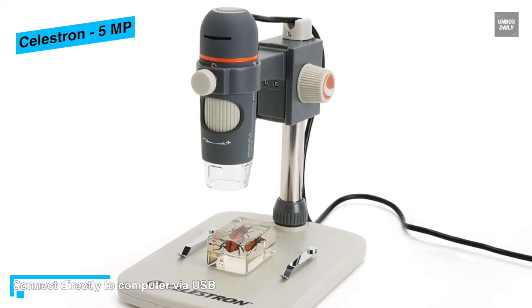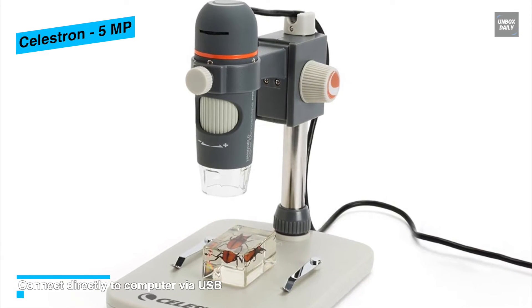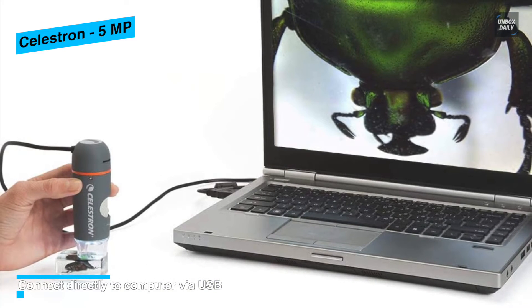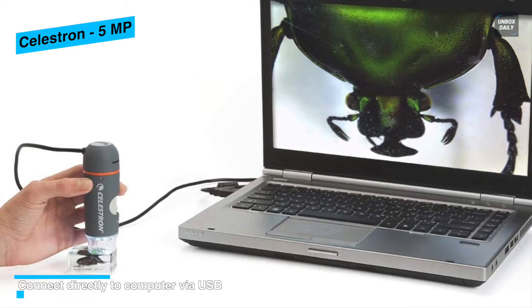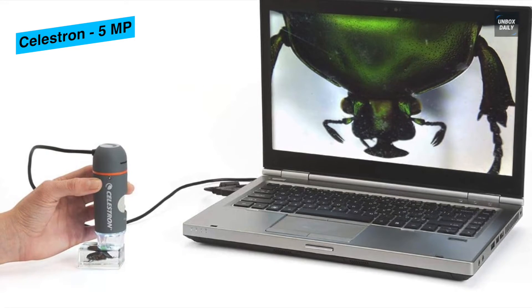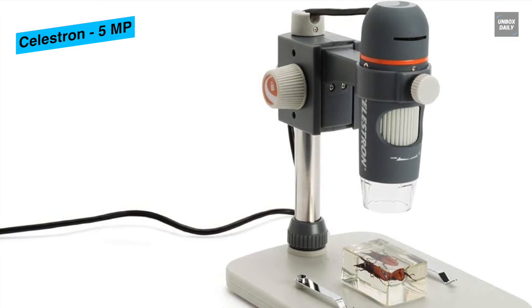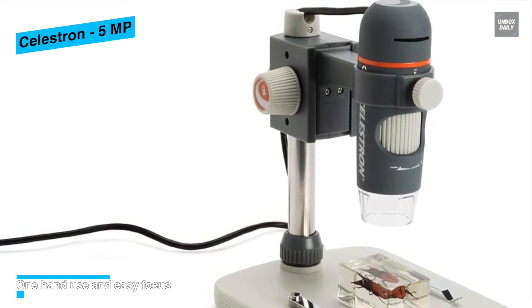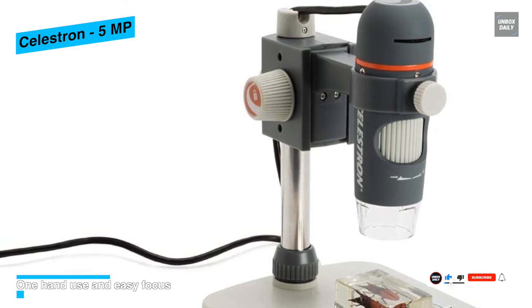Despite being a handheld microscope, the Celestron Handheld Digital Microscope Pro also comes with a height-adjustable stand, which upgrades usability by accommodating tall specimens. It also comes with a 4-foot-long USB 2.0 cable, allowing easier mobility during viewing, so the user can enjoy flexibility while the PC stays in one place.